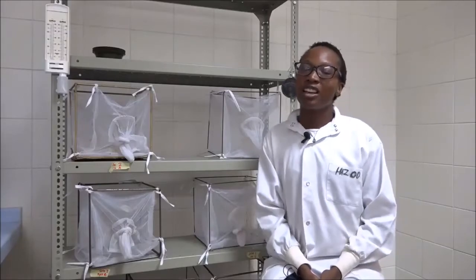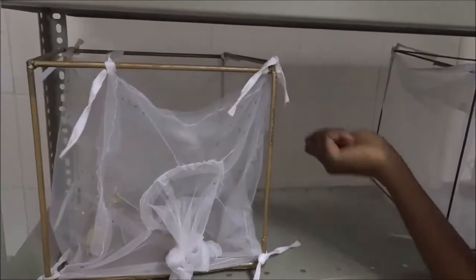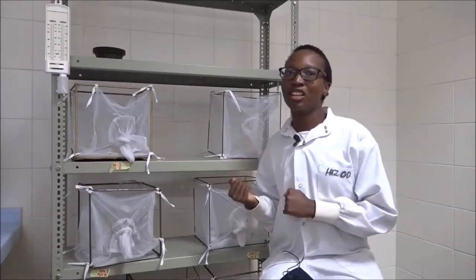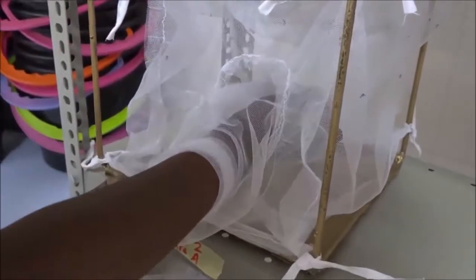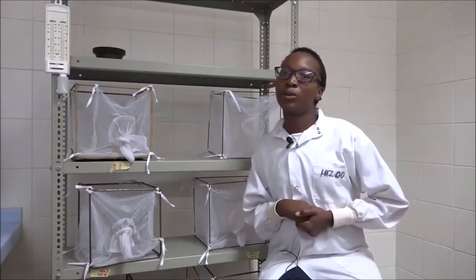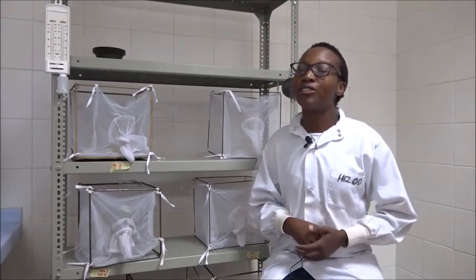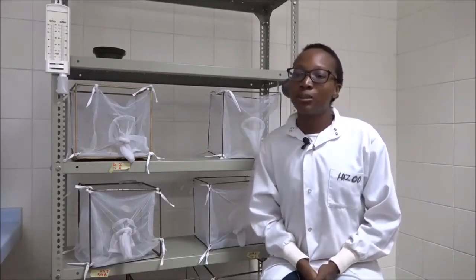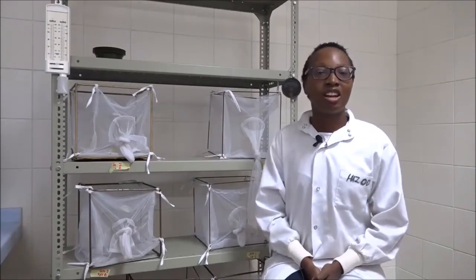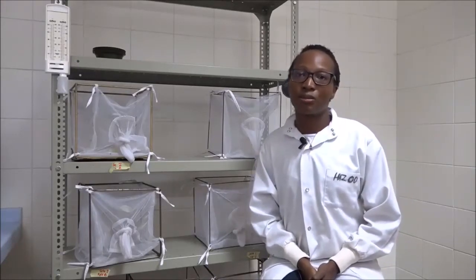And what we do here is we collect mosquito samples from the wild and then we grow them from the larval stages all the way to adults. We take the pupae from the larval insectary and then we move them into the adult insectary. Here we wait for the pupae to emerge into adults. We then feed them on 10% sucrose. If we want the adults to lay eggs we will then blood feed them. Only few people are allowed to blood feed the mosquitoes. If the few people who aren't present to blood feed them, we will then use an artificial feeding system to feed the adults.